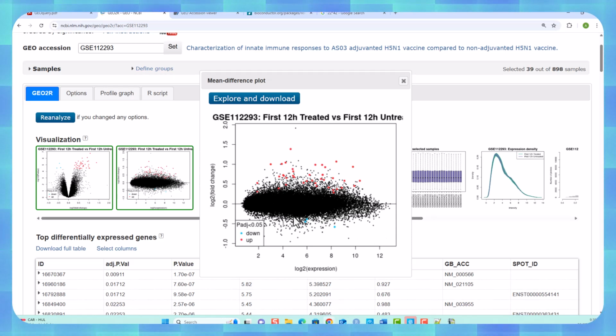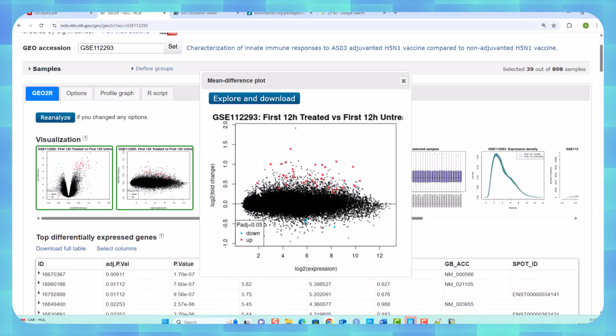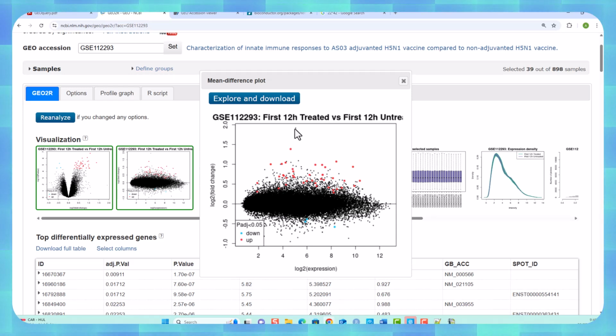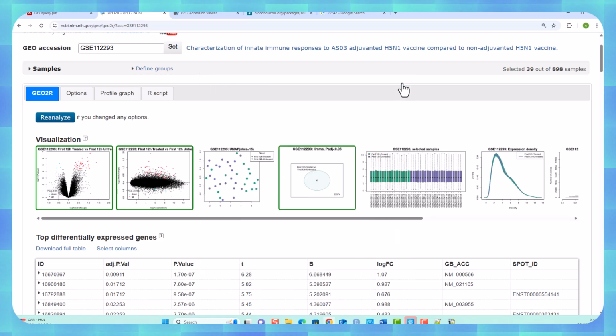You don't really need to know very much about that, apart from the genes that are in the red. So upregulation, some of them are low levels, some of them are high levels, they're all over the place. The ones that are down regulated tend to have more copies than the others, and there's no particular exciting thing. This thing over here got a massive fold change, but it's an incredibly variable gene. So because it's very variable between the 2 groups, it's not actually come out as significant.